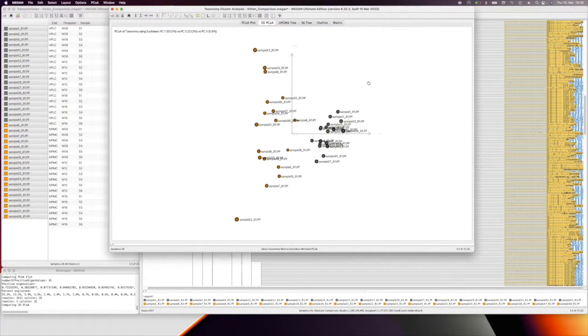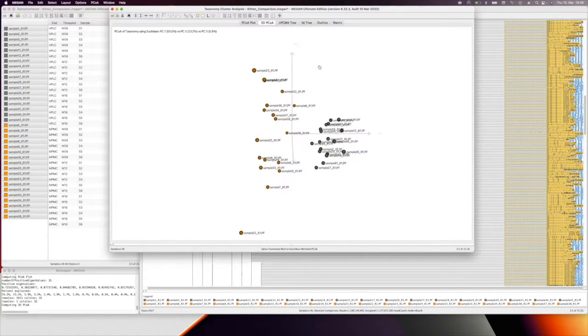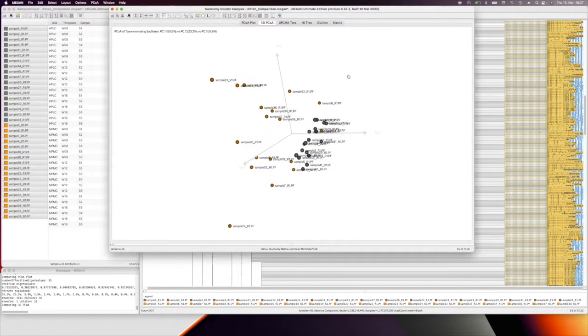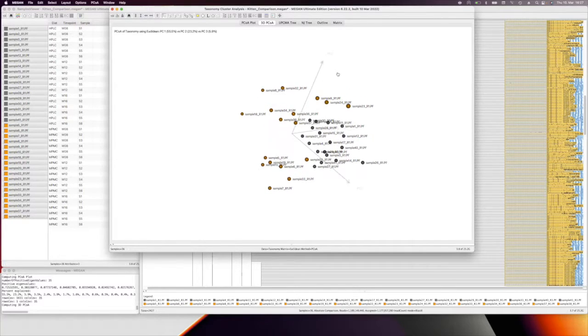So there's also a 3D representation of this. Now we have those 3 coordinates, and in this case, it's probably not helping that much because PC1 was quite strong already. So by adding PC3, we're not really getting much extra information. But again, this depends on your data set. So there are definitely going to be use cases for this.